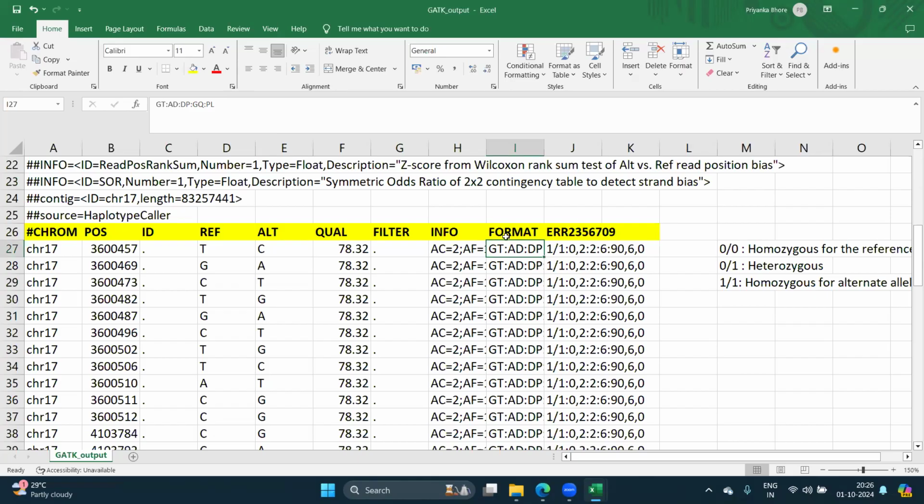Here, I'm just explaining allelic depth again. Allelic depth provides the breakdown of how your total depth is distributed among the reads supporting the alleles at the variation location.